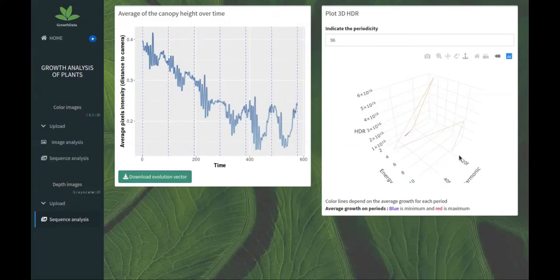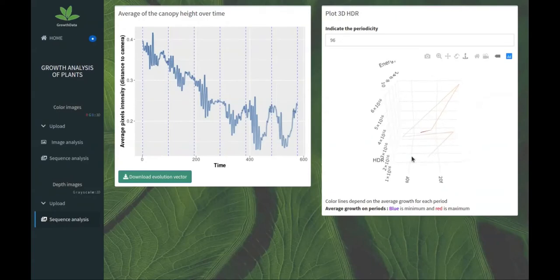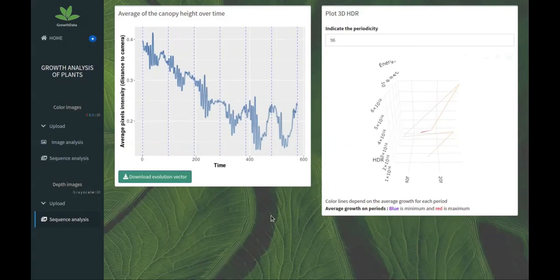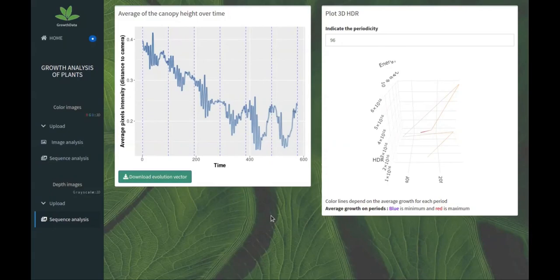On the right we have a 3D frequency analysis with a trend: daily trend, daily energy, daily harmonic, and daily harmonic distortion rates. We have the evolution over time. Here it uses the tools that we explained previously on the slides. The use of depth sensor is very important to well characterize the growth of plants. I think it's a very important tool in addition to the color sensors.